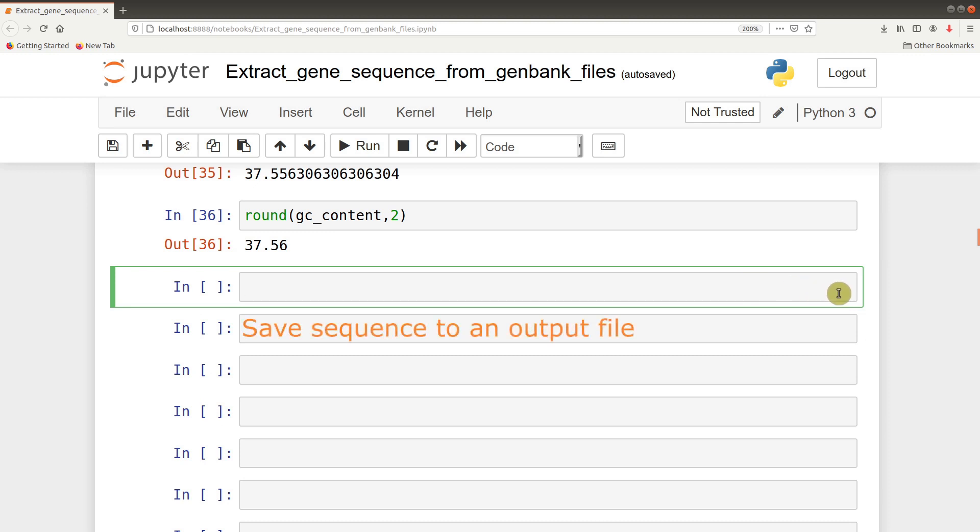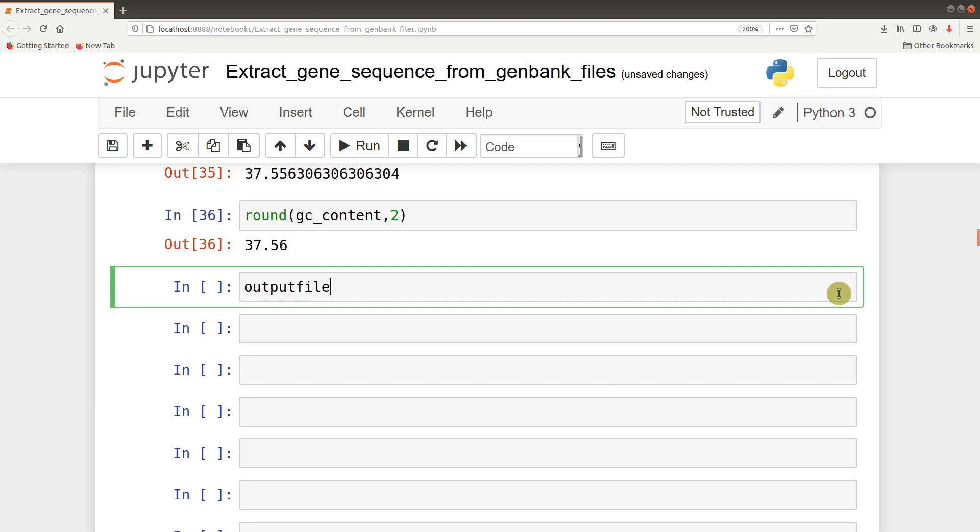Now let's move on to saving it to an output file. First, to save it we need to define the file itself and the path. Let's say output_file equals /home/.../rpob.fasta. We'll save it as a FASTA format. So let's define this as our output file.